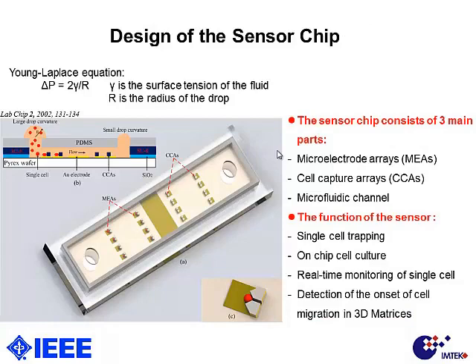Our chip here consists of 3 main parts. First is the microelectrode array: a big electrode in the center, like in the ECIS method, and 4 columns of small electrode arrays symmetrically placed on either side of the big one. Depending on the direction of flow injected inside, one side will be used for working, and the other side without cells is a reference.